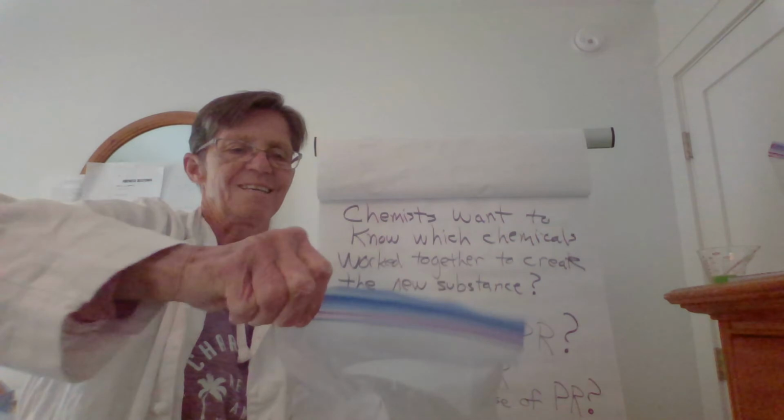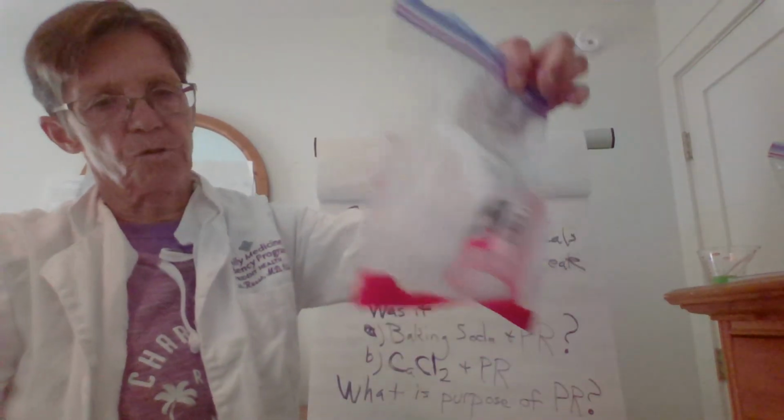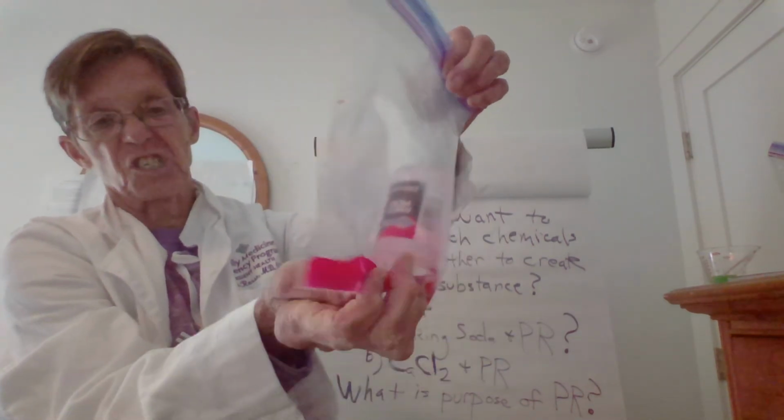Got it. I think I got it. All right, ready? It's all in there. All right, so there it is. Okay. Looks like it's cold. Definitely has a chill to it.